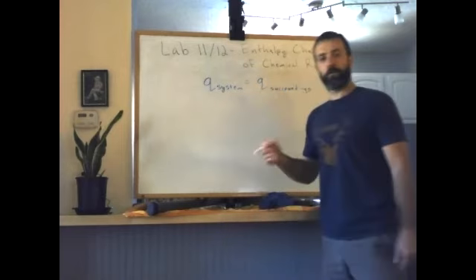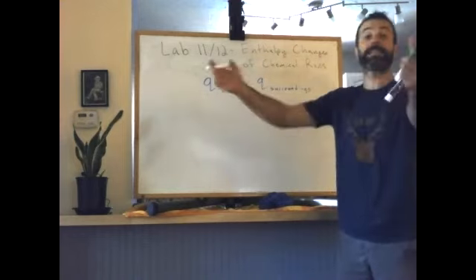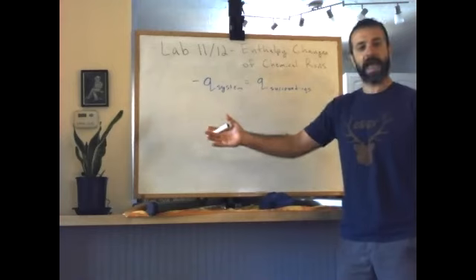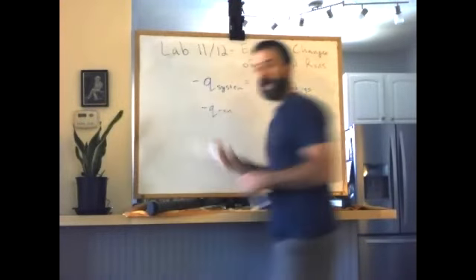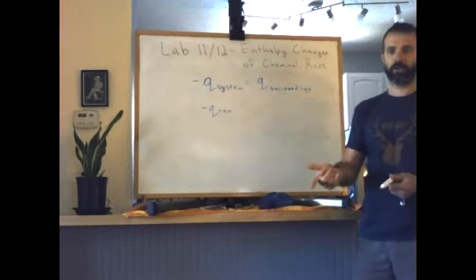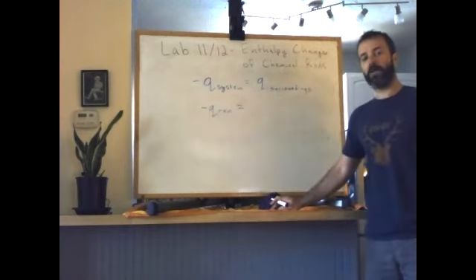But we know from the first law of thermodynamics, if we have a reaction that, let's say, releases heat, all of that heat lost by a reaction must be gained by the surroundings. Okay, so in this lab, we're really looking at some chemical reaction. We'll look at two reactions, right? Heat of solution and heat of neutralization. And the way we do that is by observing the surroundings.